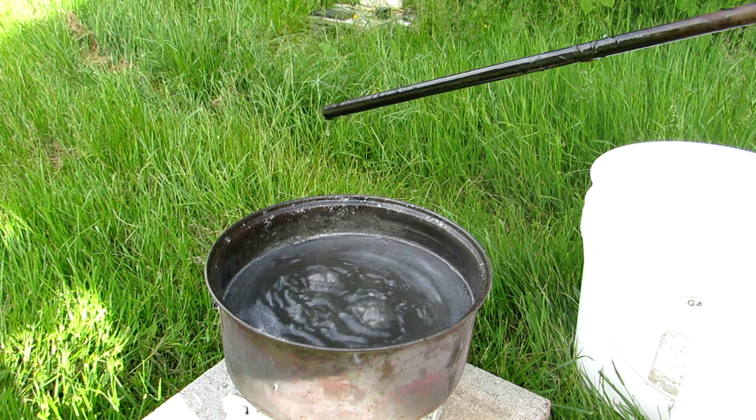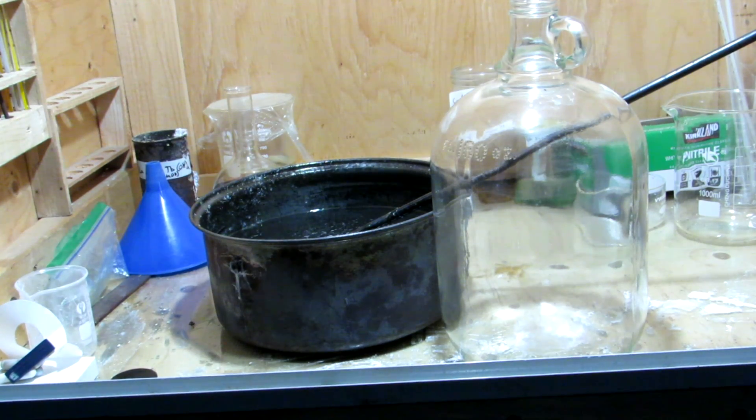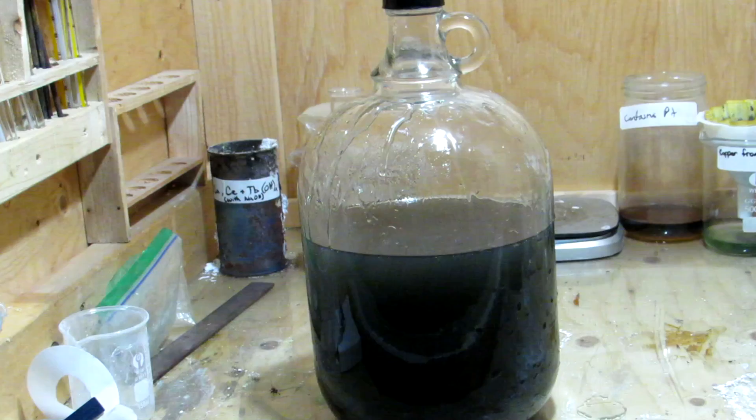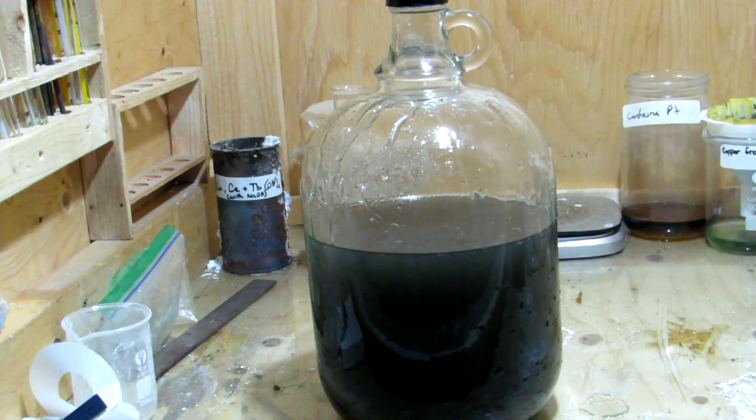Once cooled, the mixture is even more viscous. It can then be added to a large jug for storage. The solution is dark due to impurities from the pottery grade silicon dioxide. However, this is not an issue for the purposes of making refractory materials.